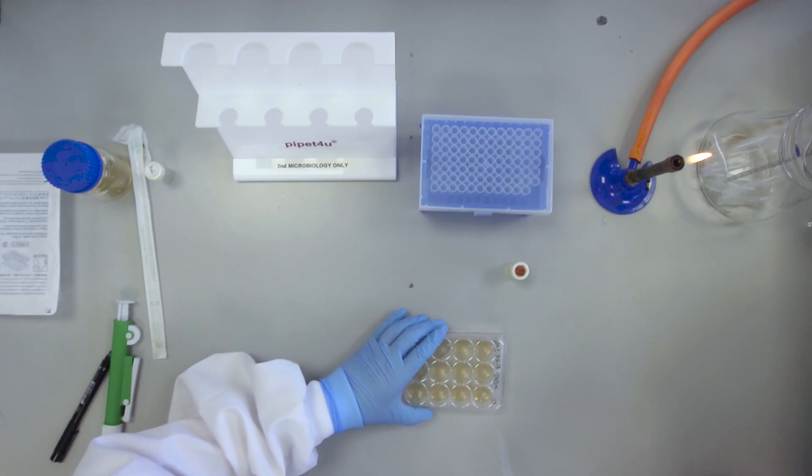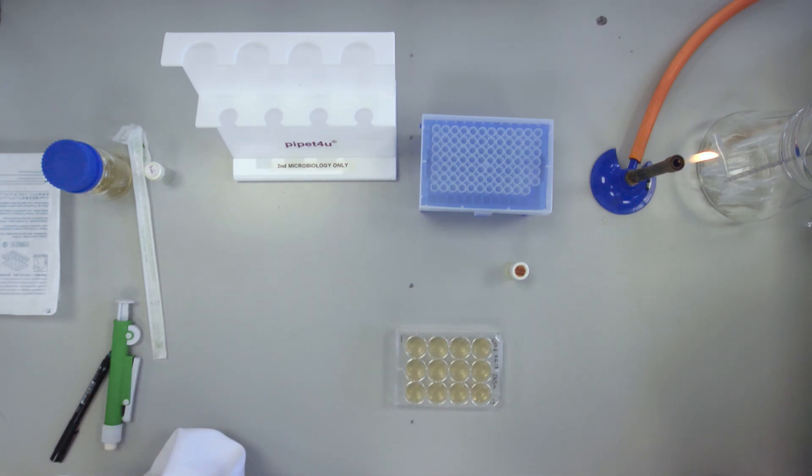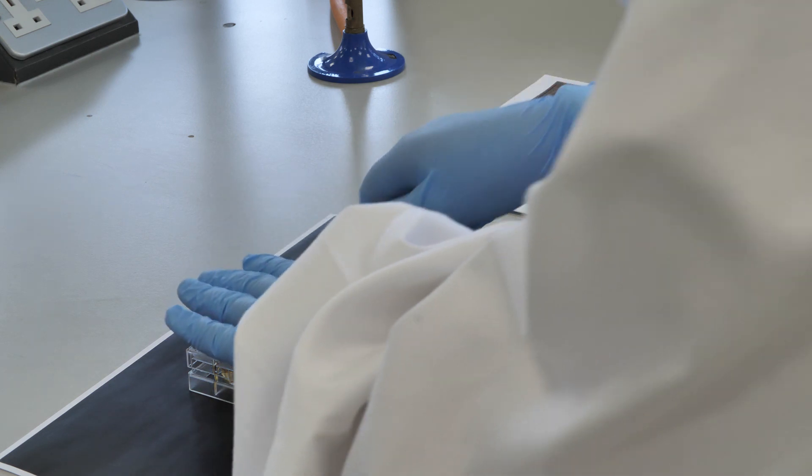The plate is now incubated at 37 degrees Celsius for 24 hours. After incubation, each well can be examined for the presence or absence of growth.